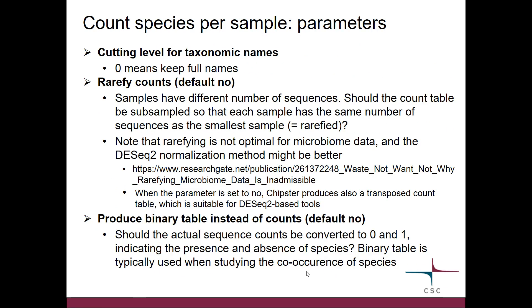Let's have a look at the parameters of this tool. First of all, you need to specify what is the cutting level for taxonomic names. By default it's zero, which means that you keep the full names, but you might want to set that to another number.